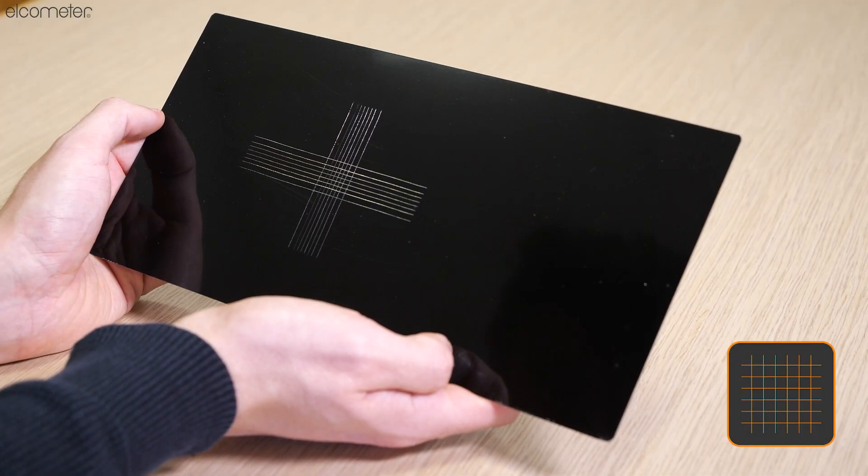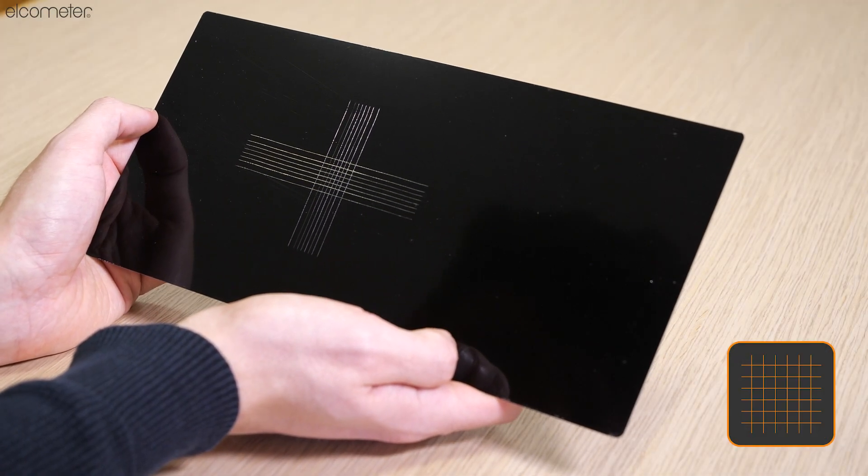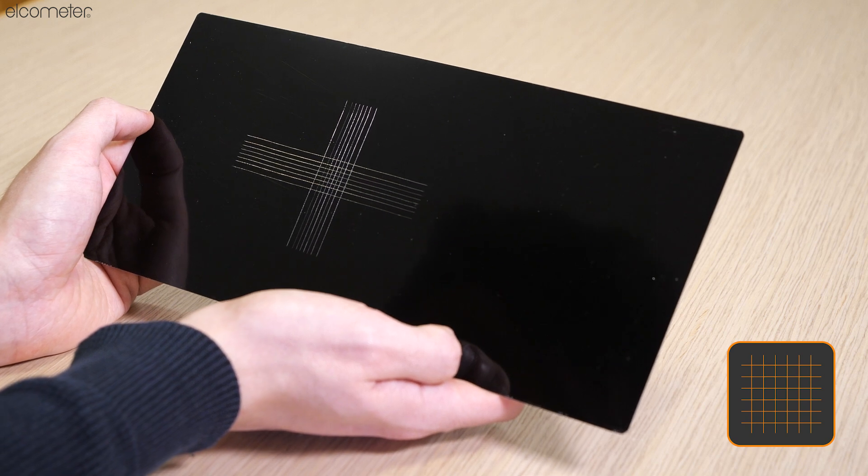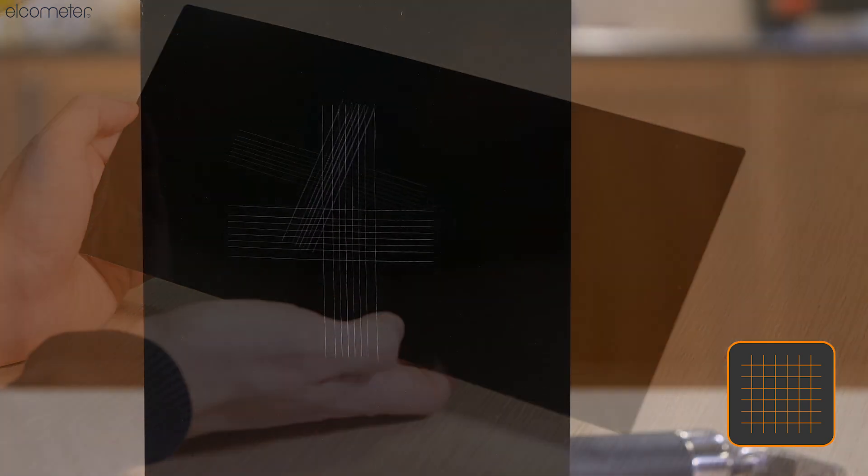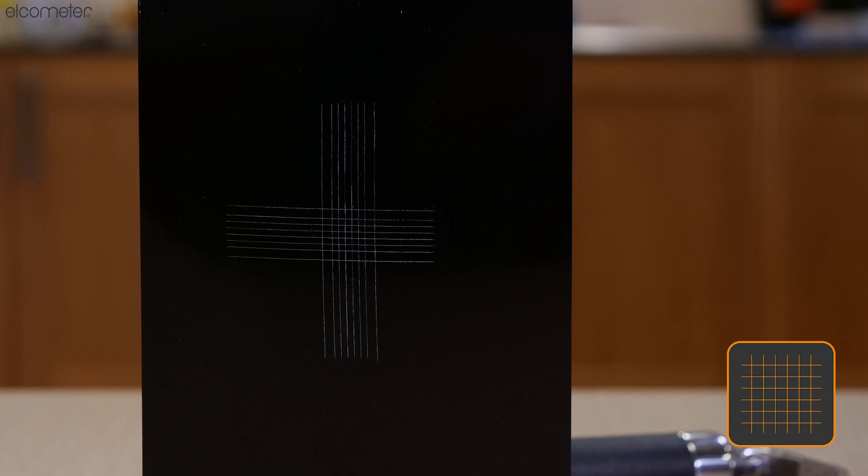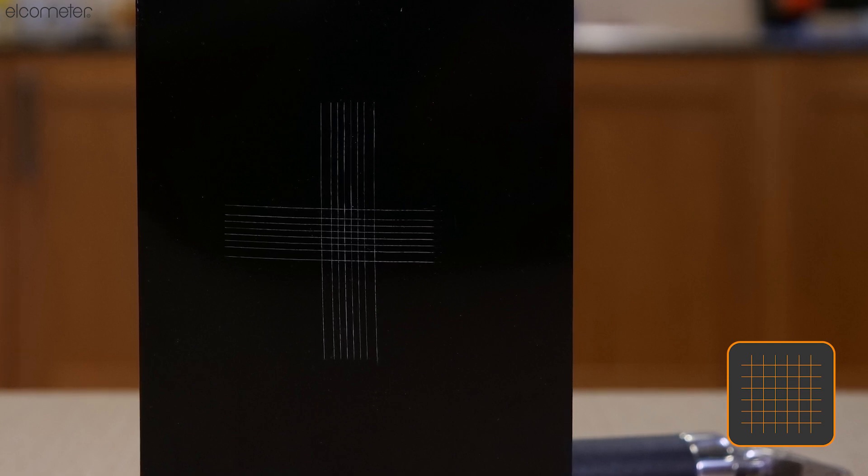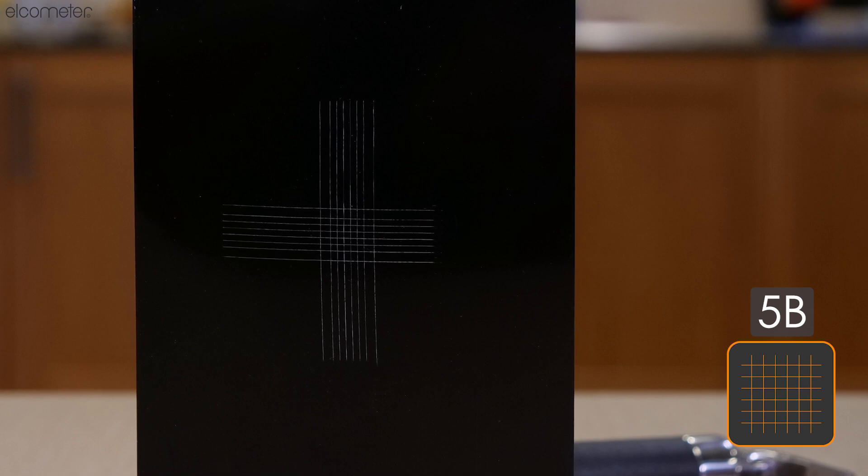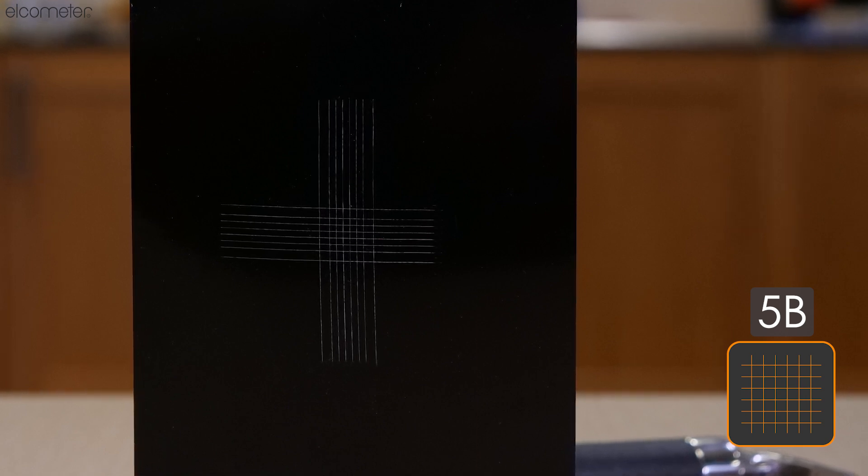As you can see from the results, the appearance of our substrate indicates strong coating adherence as the edges of the cuts are completely smooth and none of the lattice is detached. We can therefore record this as a 5B result in accordance with ASTM classifications and rest assured that the coating meets quality standards.